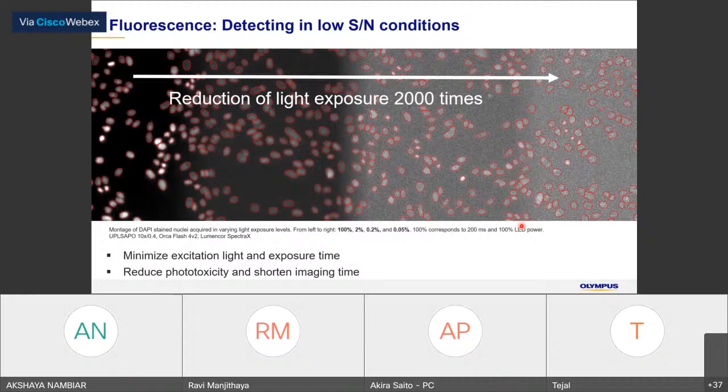If we train with a very low contrast image on this right side, you can see that these are the nuclear positions, but the contrast is very low. So of course it is very difficult to identify using a threshold or other general segmentation.